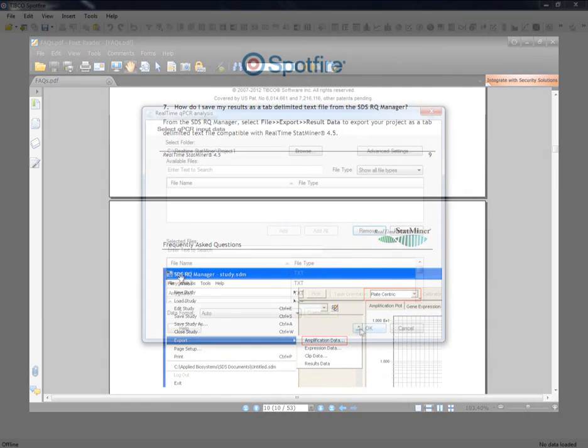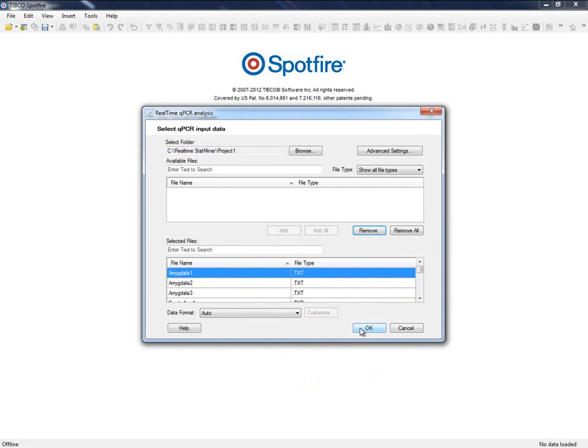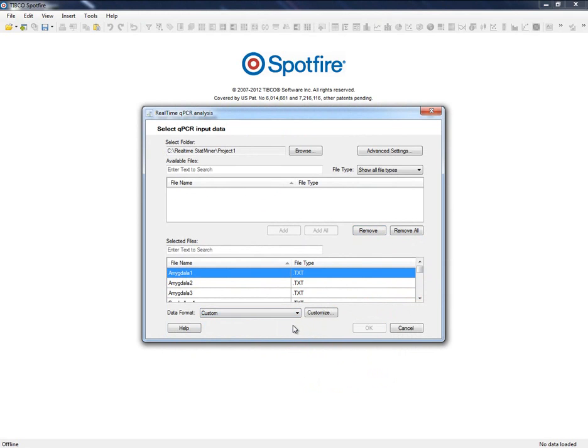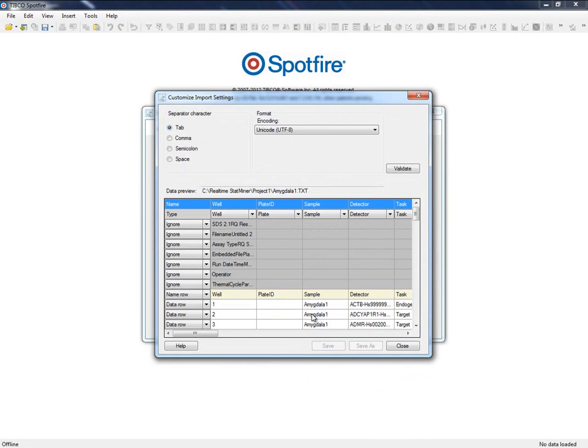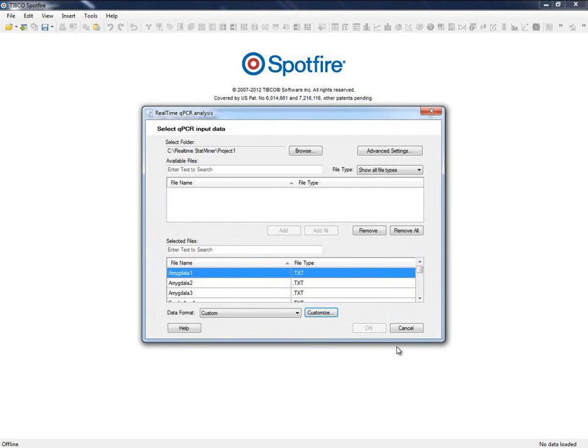In case StatMiner is unable to automatically recognize our data, the Customize Import Settings tool will help us to retrieve it. User Manual and Custom Data Reading tutorial provide further details on this tool.